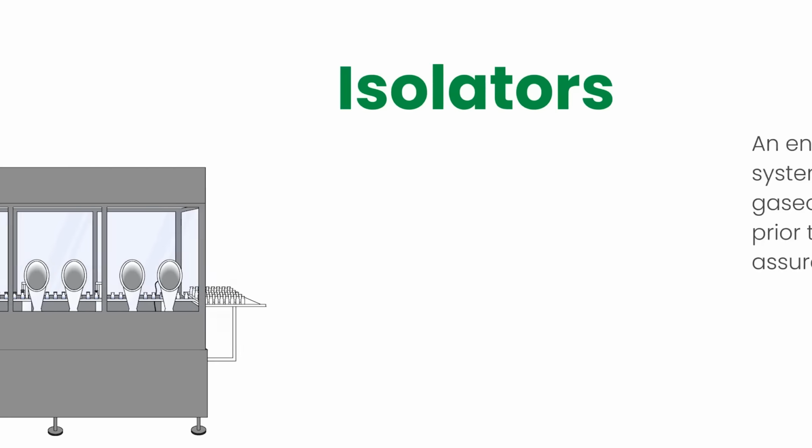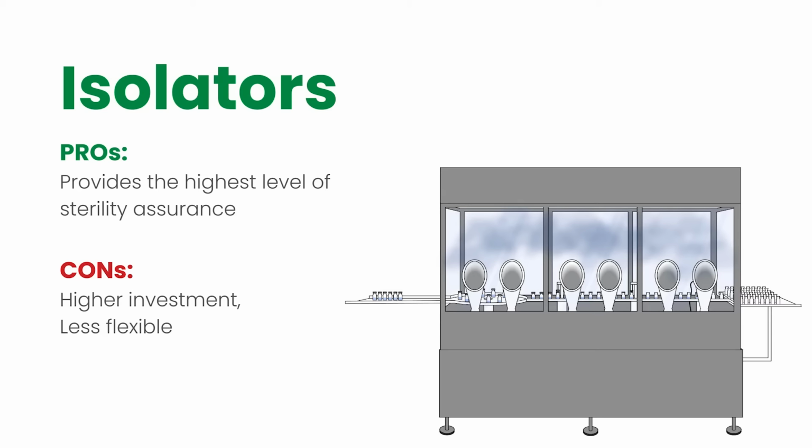Isolator technology in filling of drug products is, in my opinion, the best approach. Unlike closed RABS, isolators offer a sanitization cycle, oftentimes vaporized hydrogen peroxide or VHP. So in addition to preparing the isolator with sterile items or sterilized items, it also has a sanitizing cycle that offers further sterility assurance. One drawback of isolators is the restriction of movement that operators encounter, but in our hands, we've been able to work within that restriction and achieve good filling outcomes.